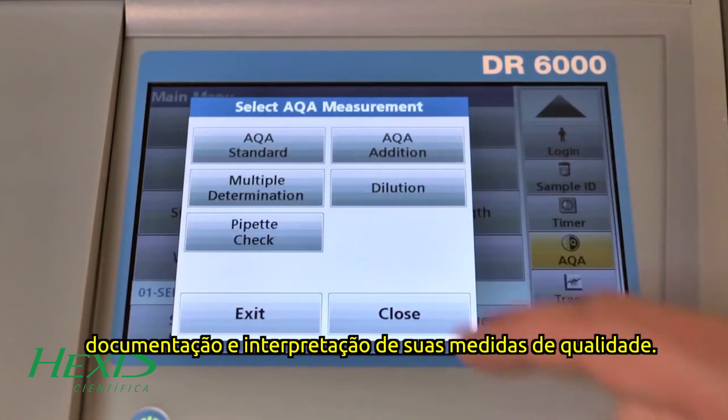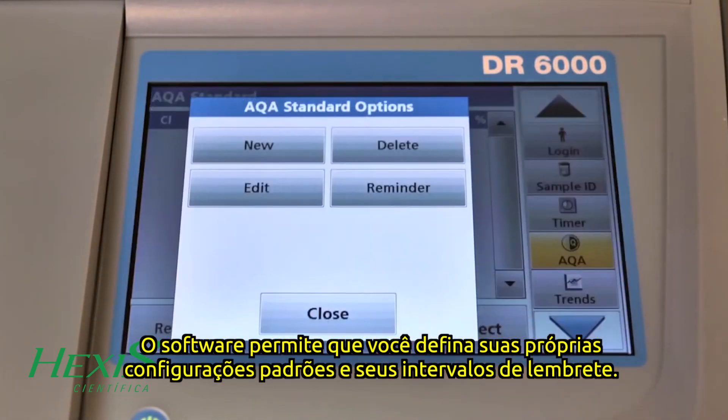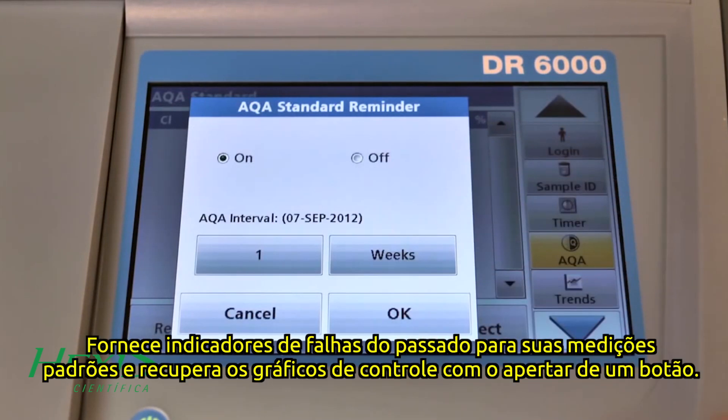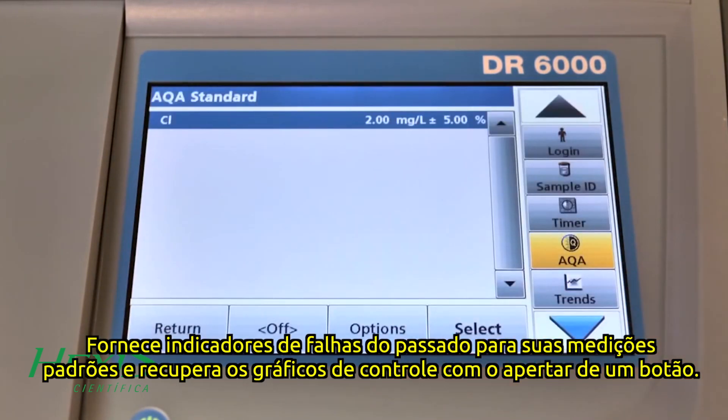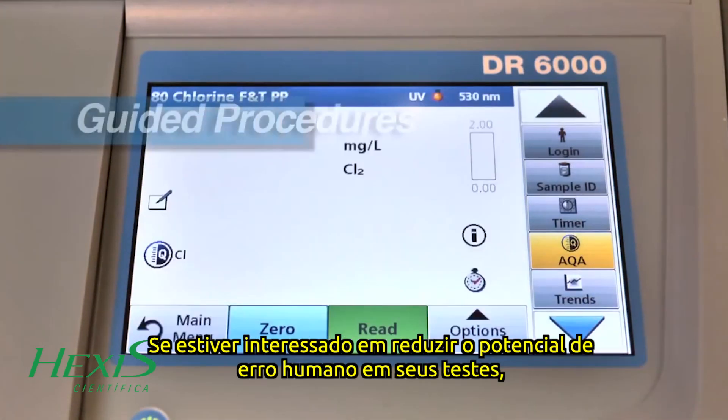To help ensure your results are error-free, the DR6000 comes with integrated quality assurance software for scheduling, documenting, and interpreting your quality measurements. The software allows you to define your own standard settings and reminder intervals, provides pass-fail indicators for your standard measurements, and recalls control charts with the push of a button.